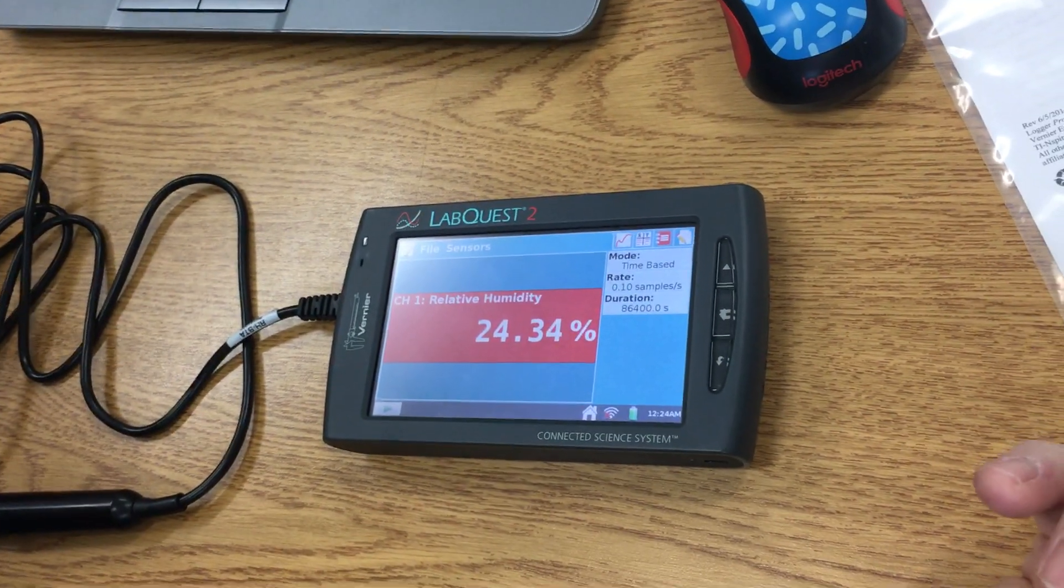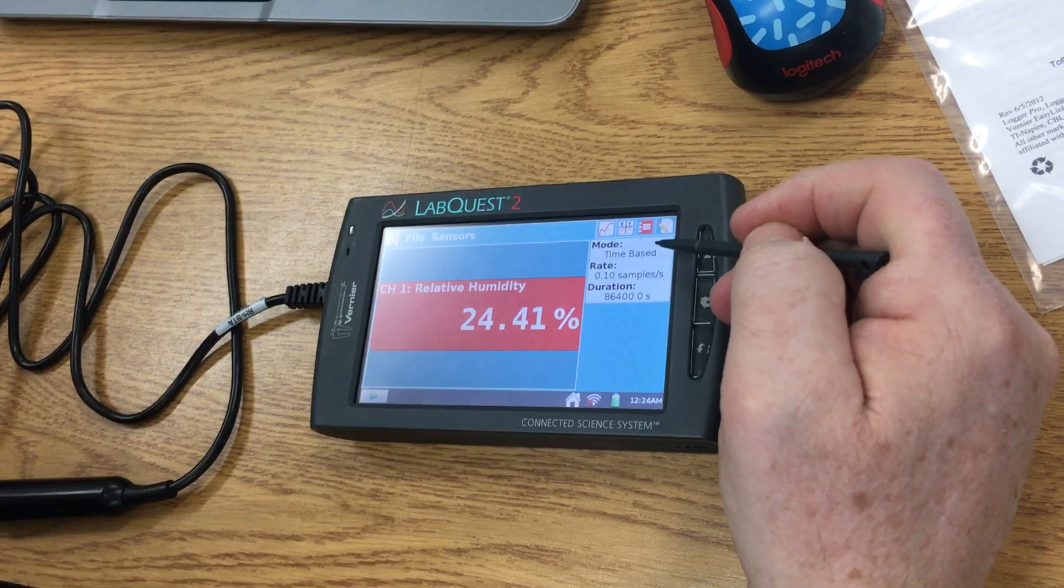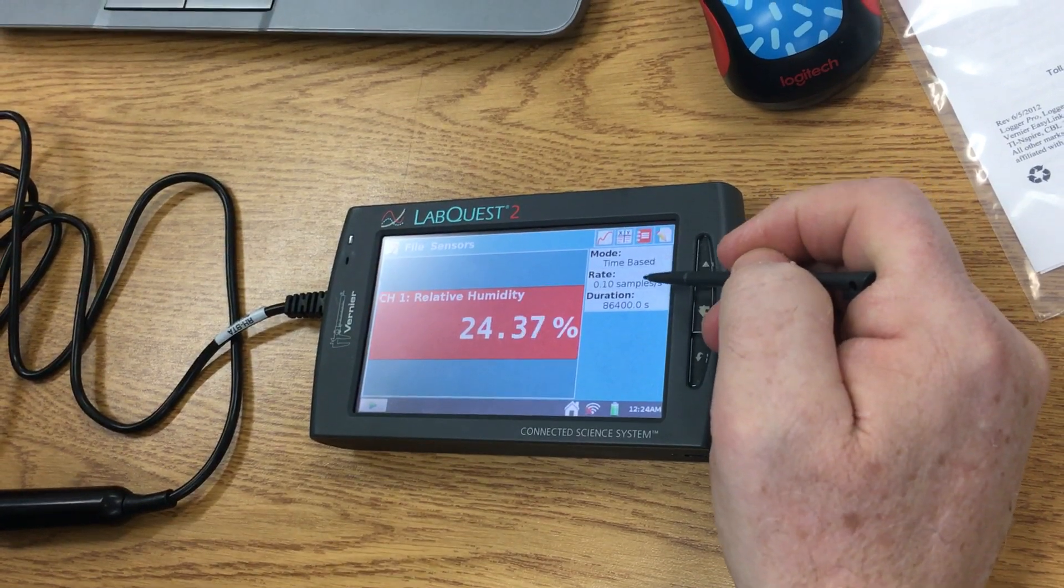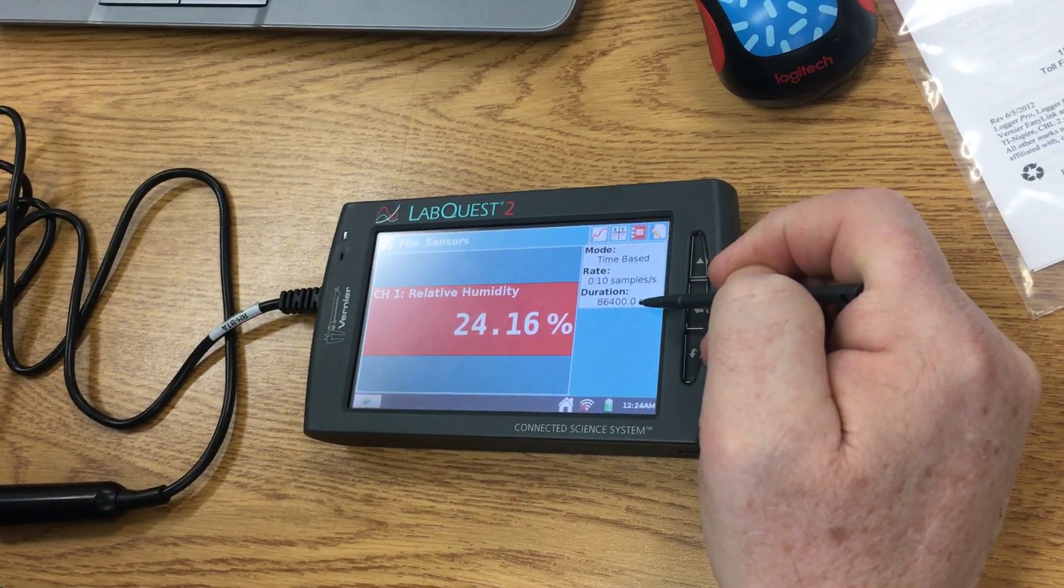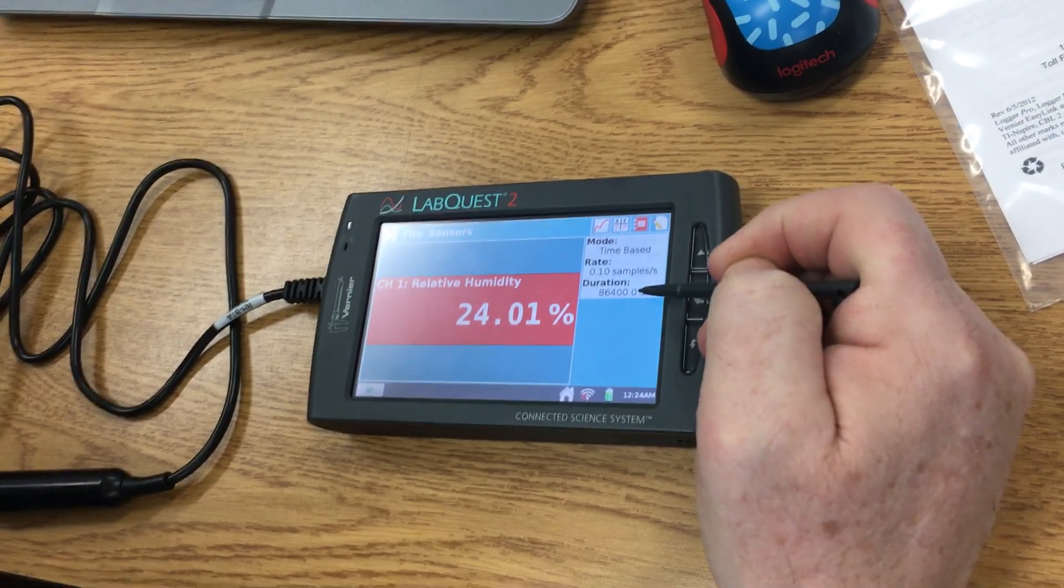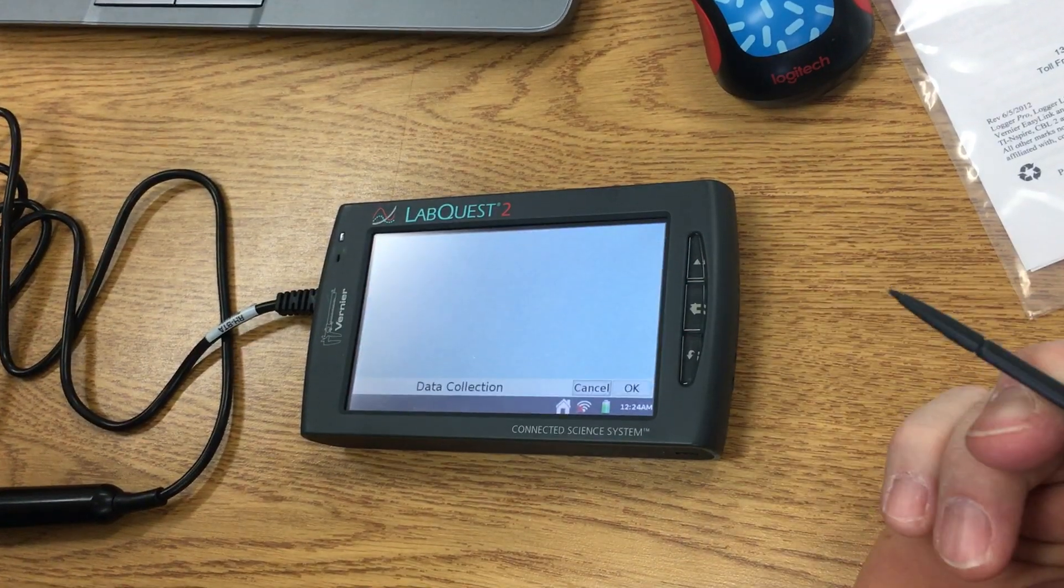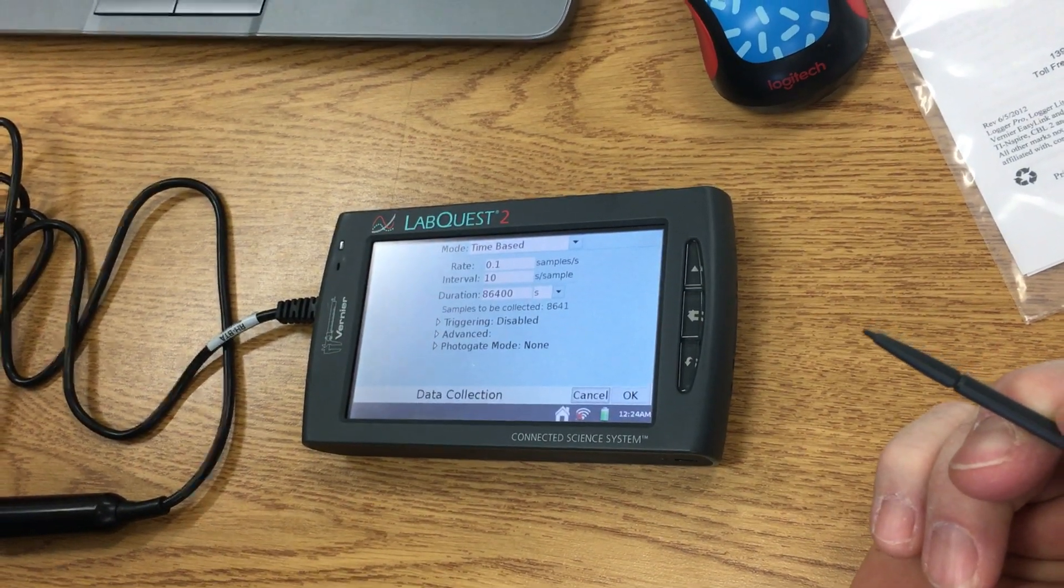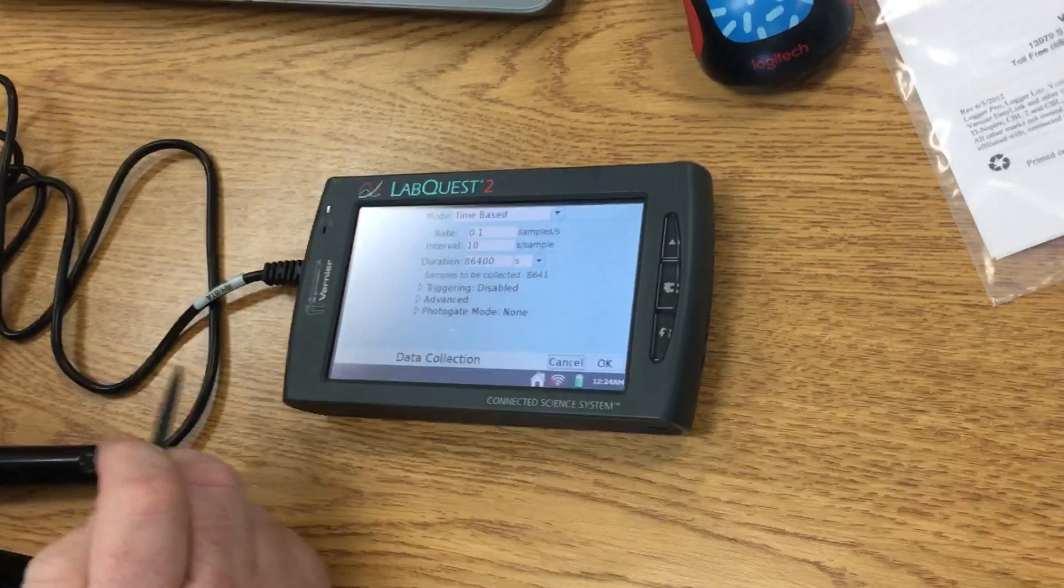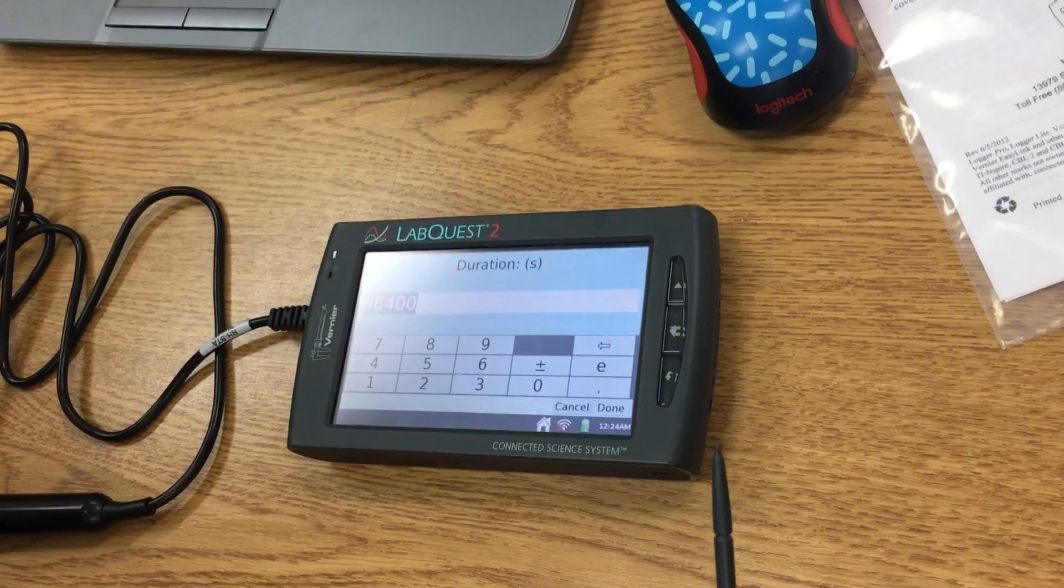We're going to change the sample and the duration, so I'm going to click on it with the stylus and it opens up to this window. The first thing we're going to need to do is change the time.